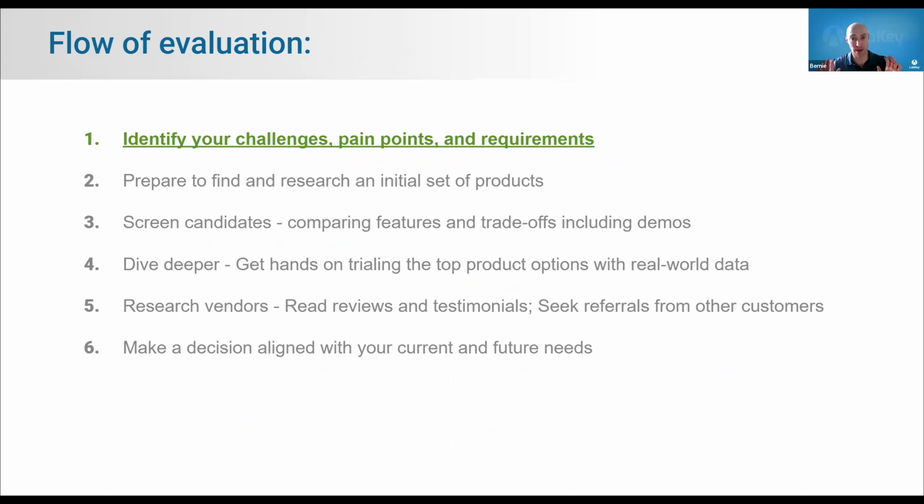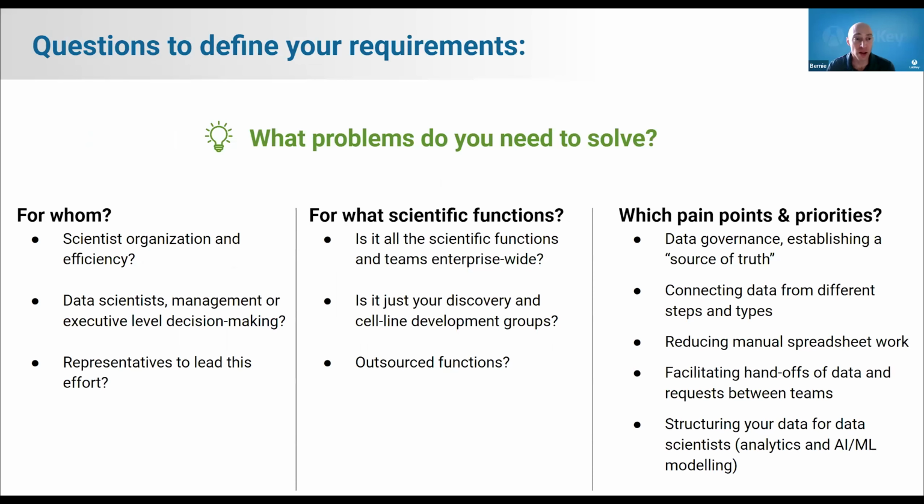Okay, so now we understand some of the benefits of the LIMS, some of the problems you might have. Let's turn towards formulating your particulars. Given the variation at different institutions, what is a useful framework for answering the question, what data problems do you need to solve, in a way that will help you evaluate and select the right tools?